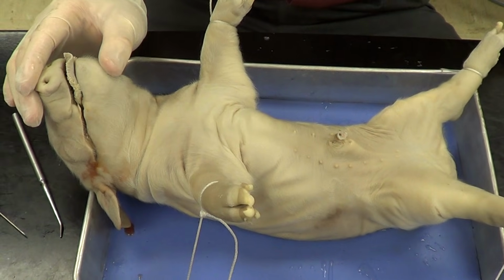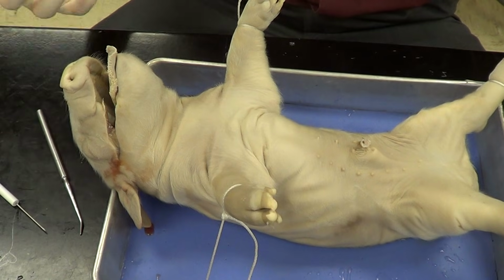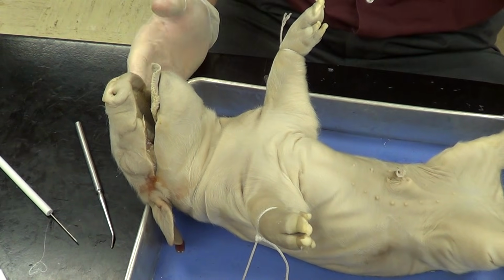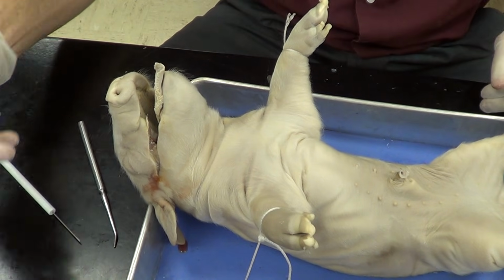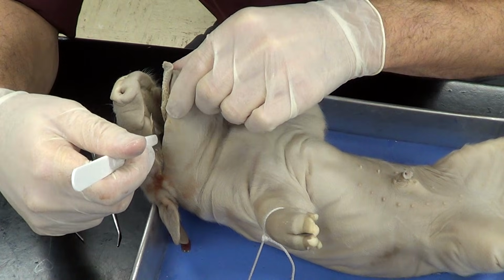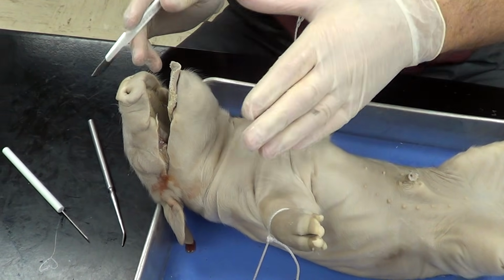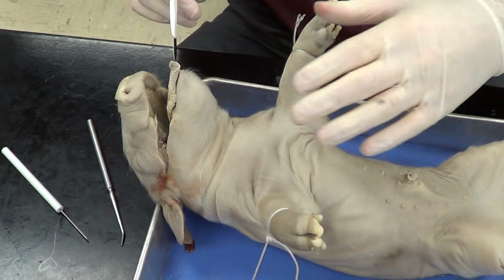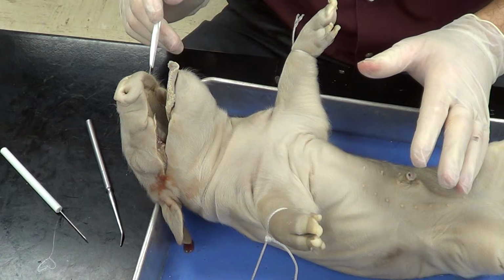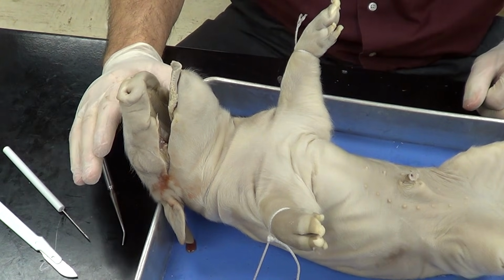Then we're going to move up and take a look at the mouth area of the pig. Now the mouth is going to be shut and the muscles are going to be sort of locked into position. So we need to free those muscles up. So what we're going to do is take a scalpel and cut the corners of the mouth here and over here. Now be careful with your fingers. Again, you want your fingers behind the blade, not anywhere near the blade in case you slip. And you're going to cut through a little bit of the bone also in the jaw.